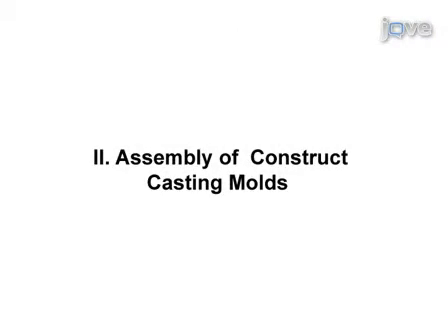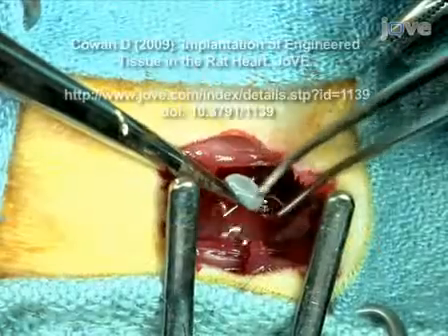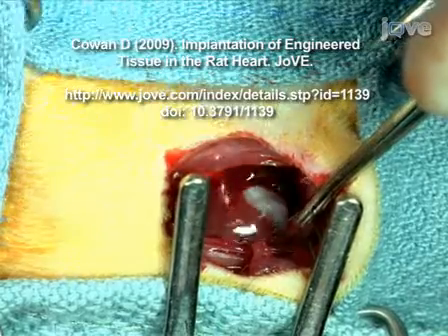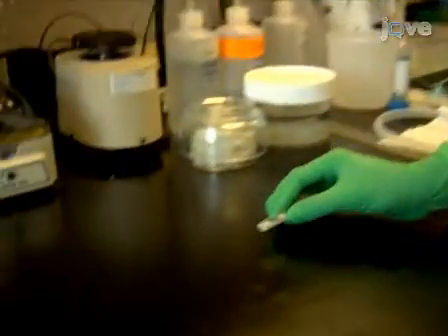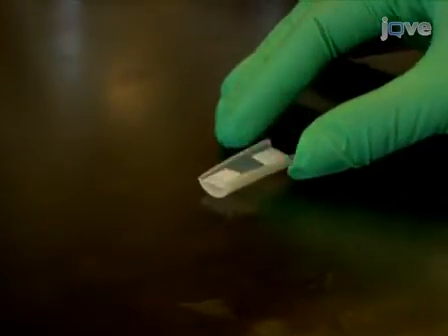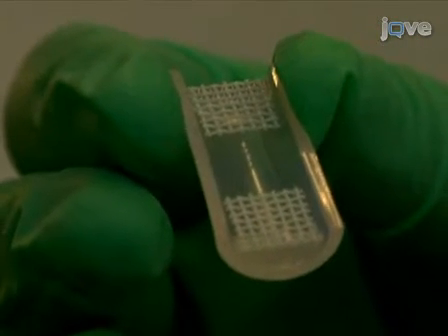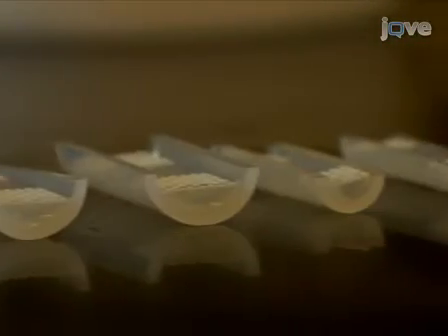The construct casting mold is used to provide a form for the surgically implantable collagen-based tissue construct. In this video, the process of creating engineered tissue constructs containing skeletal myoblasts is described. In an accompanying video, the cardiac implantation of the cellularized tissue made in this protocol is demonstrated. A tissue mold can be made into virtually any shape or size to meet the physiological requirements of any heart for which the tissue is designed. In this demonstration, the mold will form a piece of tissue that can be sliced to fit into the AV groove of an adult rat heart.